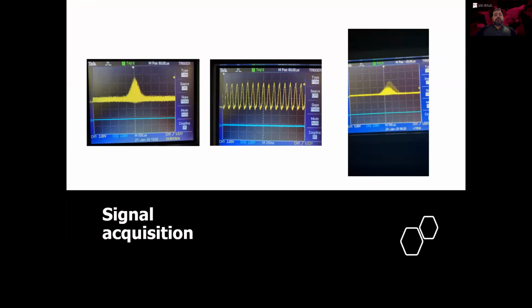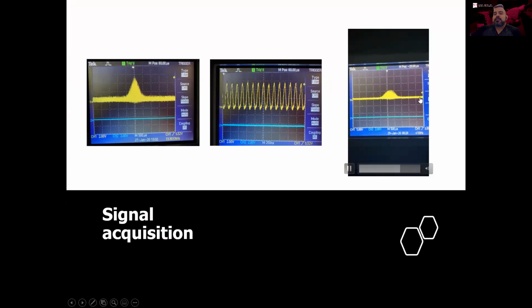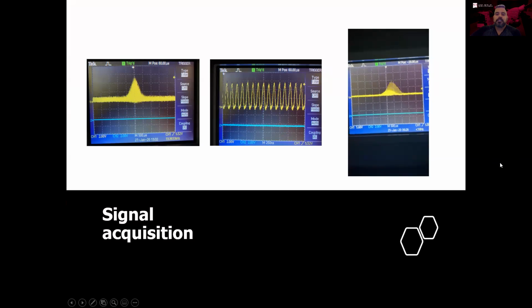Signal acquisition is, of course, a major key component of the system. Initially, when we started getting fluorescence signal, it was very noisy, and that was because of some vertical misalignments that were still present within the system. Upon correcting those and changing the time resolution to see the individual sinusoidal lobes, we're seeing a much cleaner signal, and that is depicted in this video here. You can see a very clean Gaussian envelope with our signal. There are some blips coming in here and there. That's due in part to some doublets coming in. That's okay. This is without acoustic focusing.